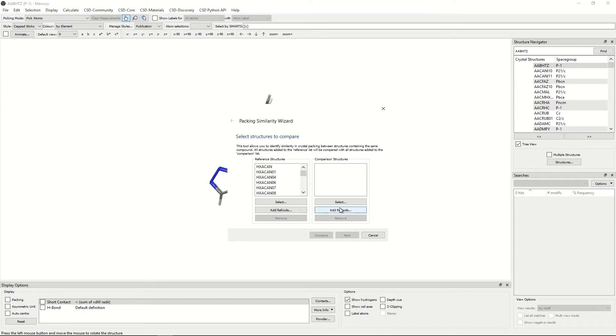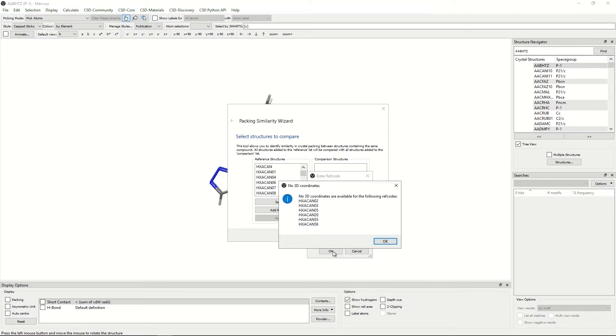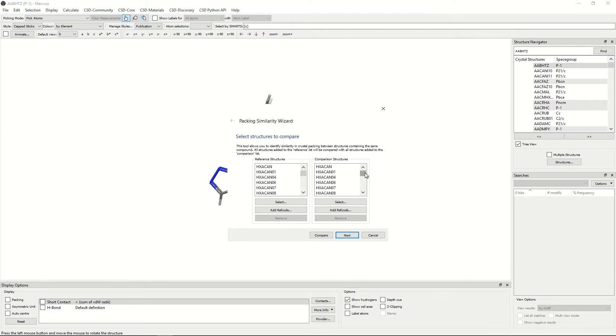We will then do the same with the comparison structures, click add ref code as it's already typed in. The box is already ticked. We'll again click OK and OK. Now we have the entire paracetamol ref code family in both the reference structures and in the comparison structures.